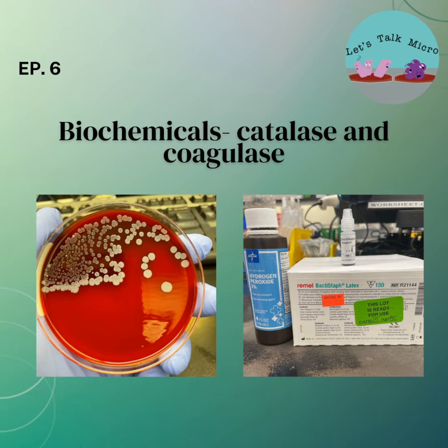So I know what you're thinking, especially you students out there. How will I be able to tell this reaction? I'm taking a test. Do I call it positive? Do I not? Well, this is what I always like to say, that you have to correlate the morphology of the organism to your biochemical reactions. Even if you have something that's off, at least you know that you might be on the wrong track.